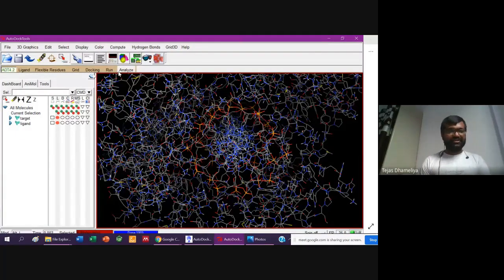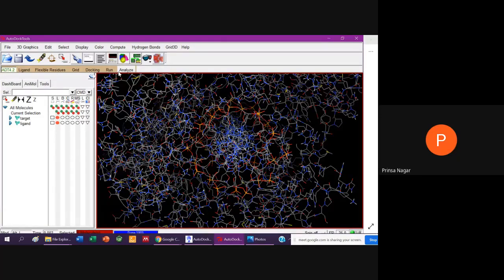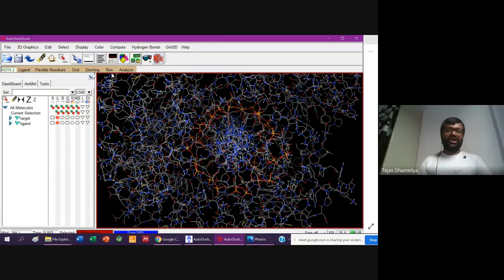Up till now, is there any question? You can ask the question if there is. No, sir. Okay. So now it is the time to run AutoDock. Our protein is ready, ligand is ready, grid is ready. We should run AutoDock.